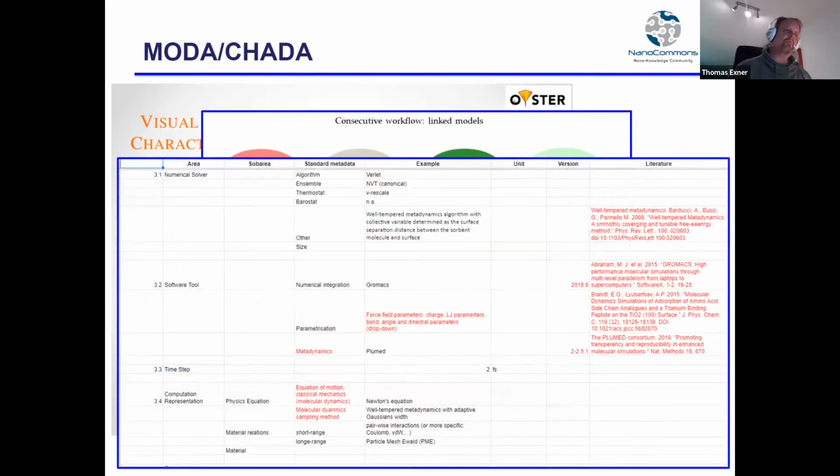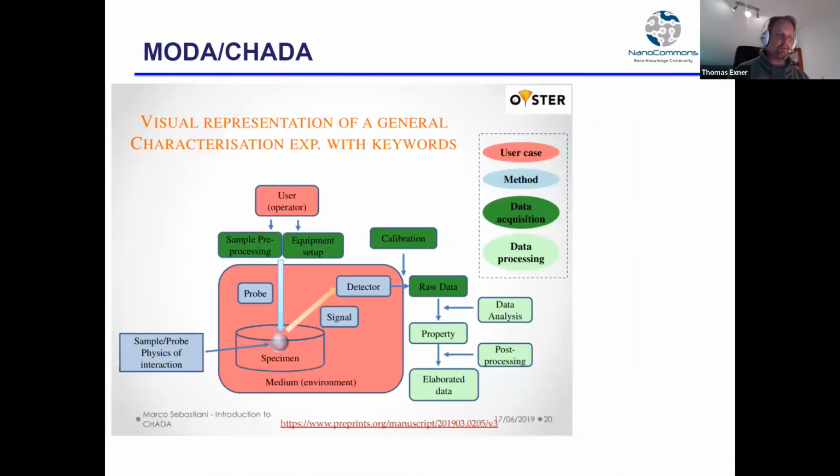And we also now try to structure the data a little bit more, to show what these metadata files are. But one important thing to remember, when I hand over to Martin, is really this: there are these defined areas which they ask people to provide, and I think that is also something we should think about when we think about SOPs.